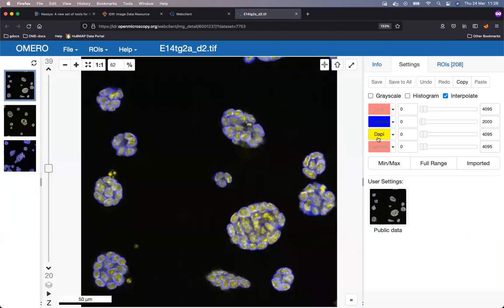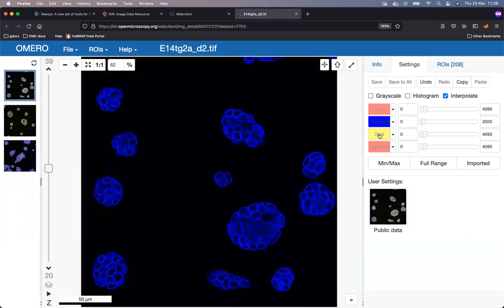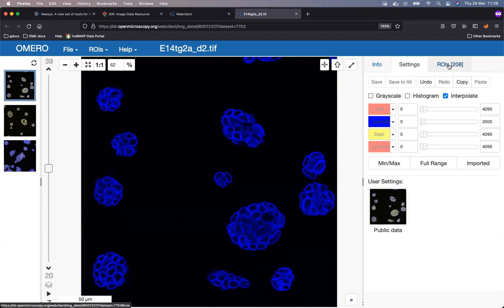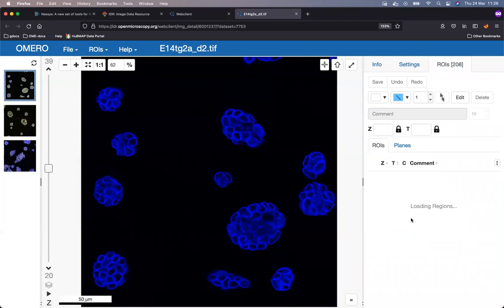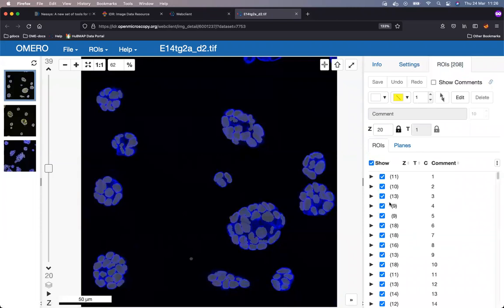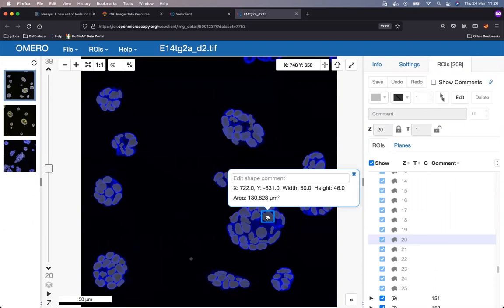Then I will switch off the DAPI channel because I know this is better for display of the ROIs, which I am here mainly to show you. So I will go now and click on the ROIs tab and the regions of interest are loading. These are the mask types of the regions of interest of the type mask, which were turned into ROIs in IDR from the labels submitted by the authors in those TIFFs as mentioned previously.